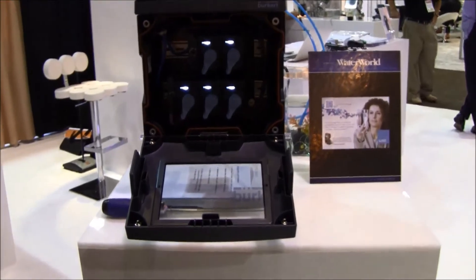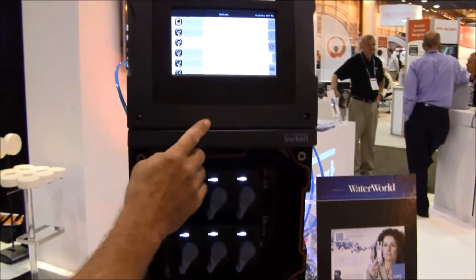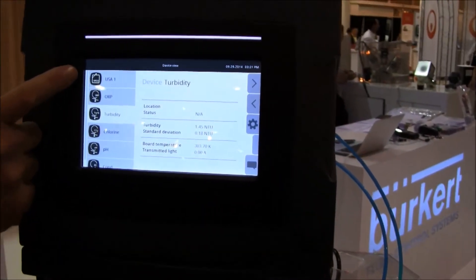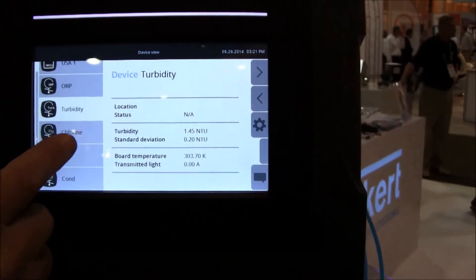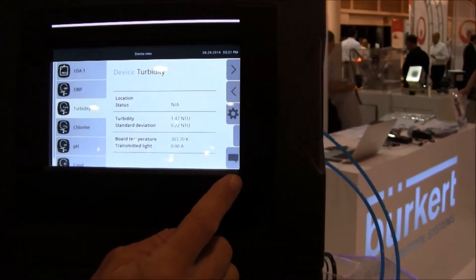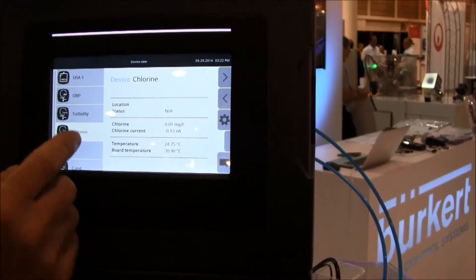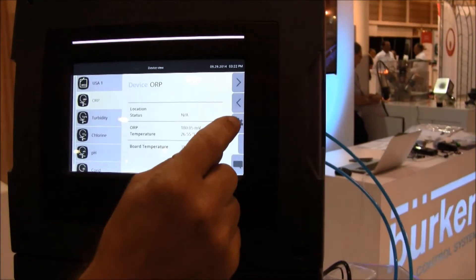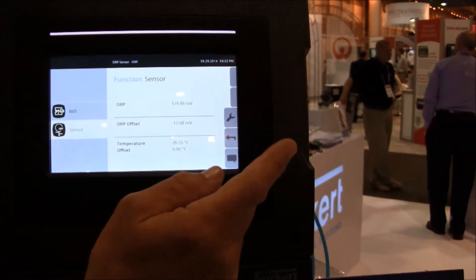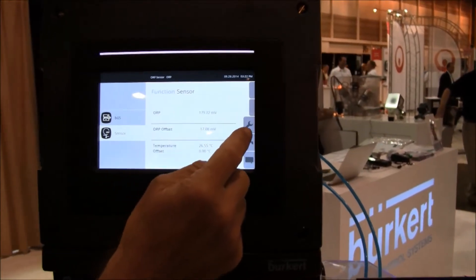Let's talk about configuration and parameter settings. On the main screen you find on the left side all the sensors which are connected, and on the right side you find soft keys. Since we have a touch screen, you select what you want and based on that you can make settings for the sensors, including calibration functions. You do this all with this interface.